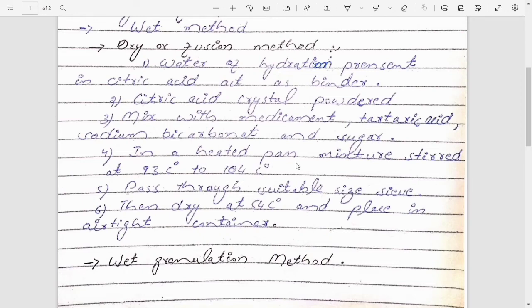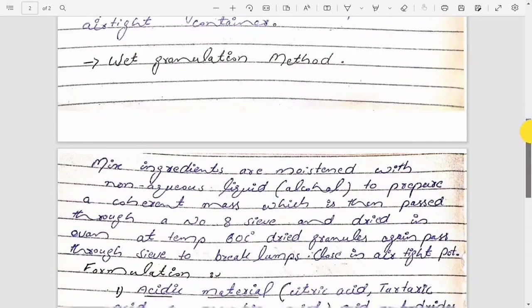After mixing, we will transfer this mixture into a heating pan. The range of temperature of the heating pan is from 93 degrees centigrade to 104 degrees centigrade. We will stir the mixture in the heating pan. After some time you will get a soft mass. That soft mass will be passed to a suitable size sieve, so we will get the desired size granules. Then we will dry these granules at 54 degrees centigrade and after drying we will store these granules in airtight container.